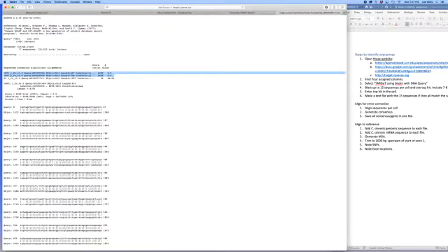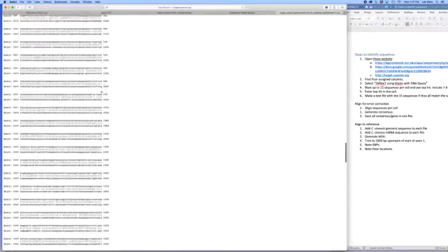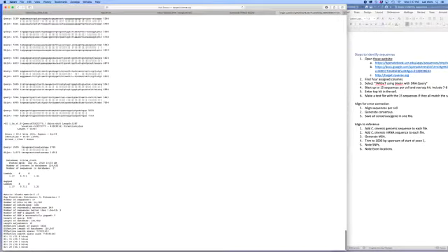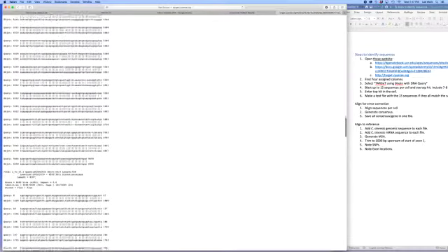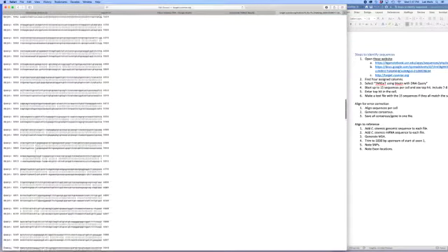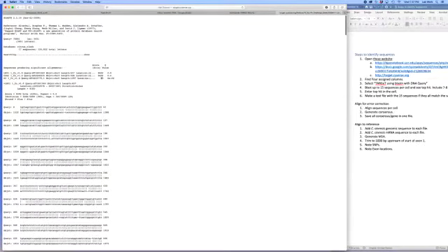We'll come back to that. They have the exact same scores and the exact same E value. Then you get this little match here, but it's tiny. It's a score of 40, very small, for GI. And if we scroll down through here, we'll see that this is it, and that's not a legitimate match. That is not useful at all. But if we scroll through, this match is pretty good, actually very good, and so is the particular one.